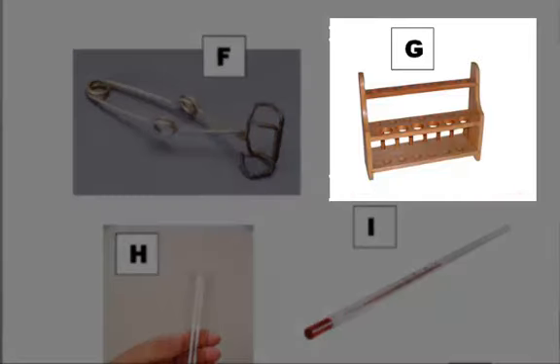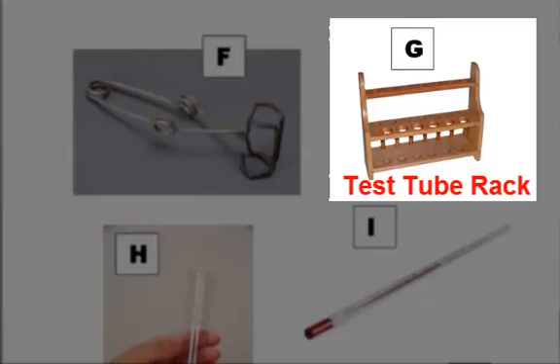G is going to be a test tube rack. The different holes will hold test tubes and in this rack, you have two different levels, so you can hold a number of test tubes. I also like to put thermometers in that and I really like to put glass stirring rods in that because glass stirring rods and thermometers are round and they can easily roll off the table. So when you're not using glass stirring rods or thermometers, I like to stick them in the test tube rack.